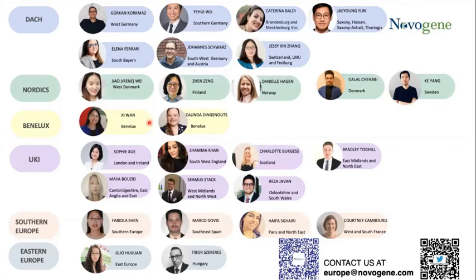Okay, wonderful. I'm going to squeeze in one more short question, Zimin, sorry. Does Novogene provide a lincRNA or mRNA modification detection service? For example, sequencing mRNA and showing the m6A modification location in the sequence? So m6A is widely used in RNA methylation. For this, the clients can do the enrichment by themselves, like RIP-seq. They will do the pull down, and we can accept samples after the pull down and perform RIP-seq. For long non-coding RNA, what we normally provide is just a basic long non-coding RNA service. Okay. Perfect. And that requires total RNA.